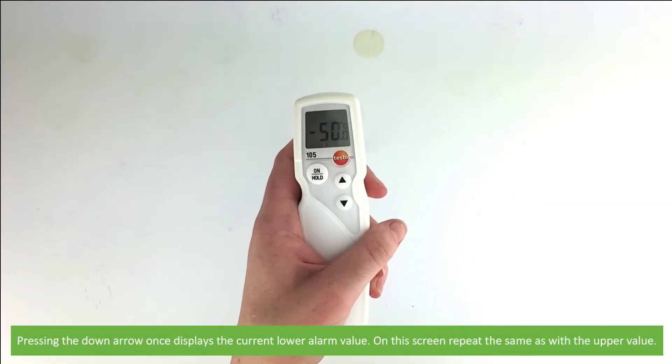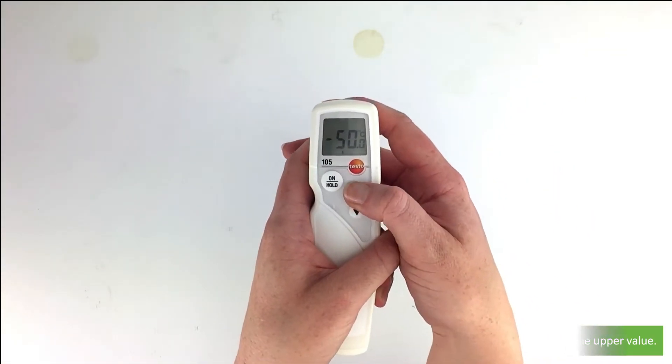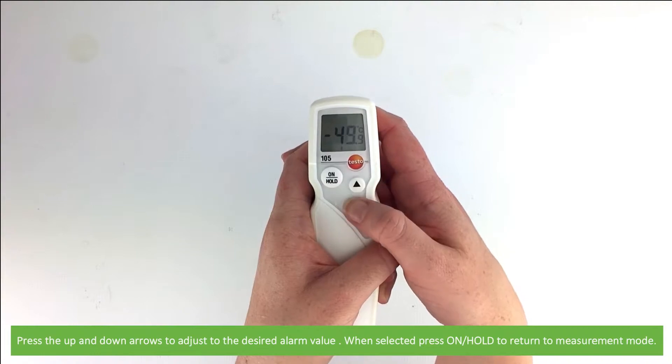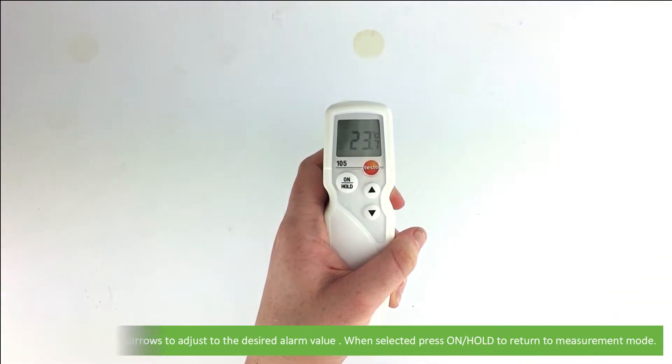Pressing the down button once now displays the lower alarm value. On the screen, repeat the same as with the upper value, pressing the up and down arrows to adjust to the desired alarm value. When selected, press the on hold button to return to measurement mode.